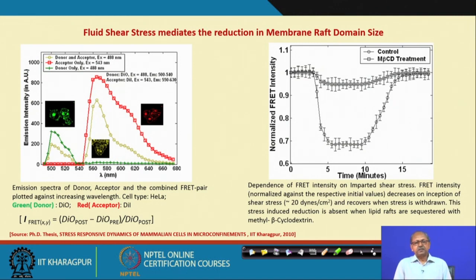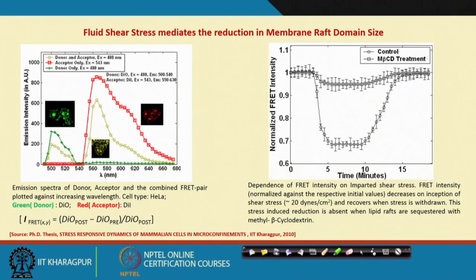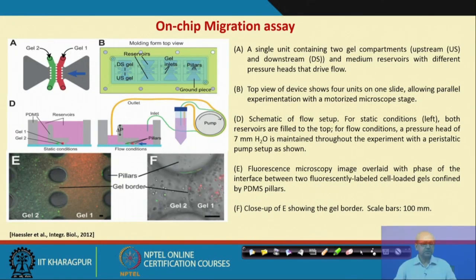Besides these experiments, there are some experiments undertaken in a microfluidic platform to assay cell migration. Particularly in the tumor environment, cell migration is very heterogeneous. So, to understand that heterogeneity of cellular migration, the microfluidic platform is very important rather than the macro-scale Boyden chamber. So, what strategy is undertaken in that process?